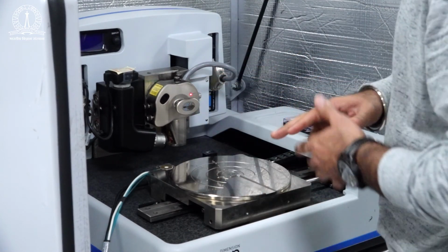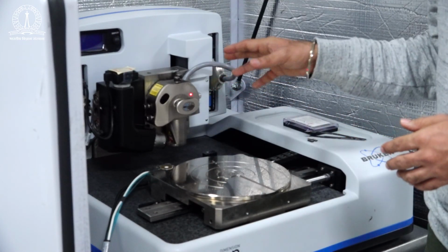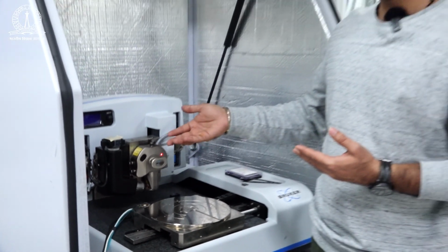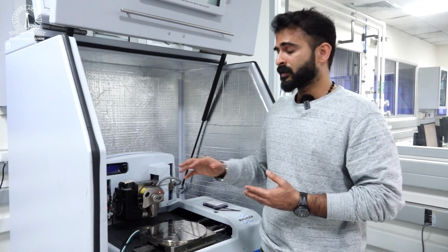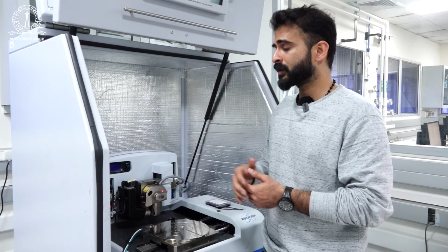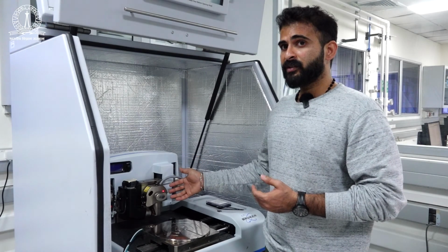So like this we handle the AFM very carefully, and what is expected of any user is to handle the instrument in a very cautious way, so that it doesn't damage the scanner head part.